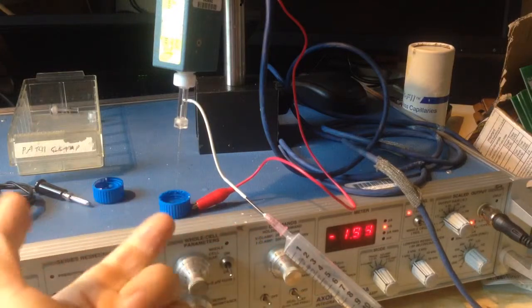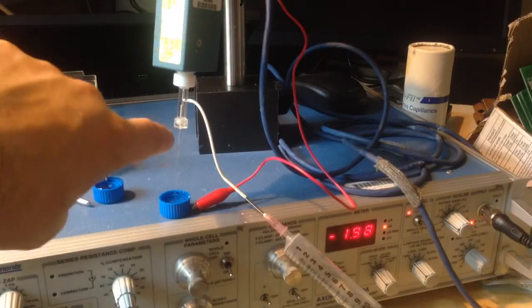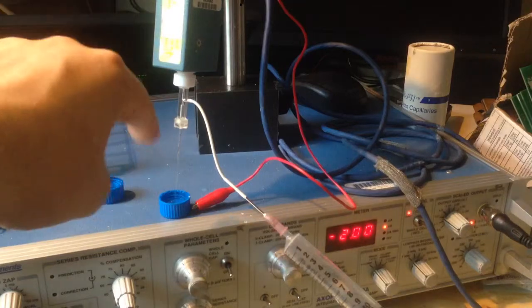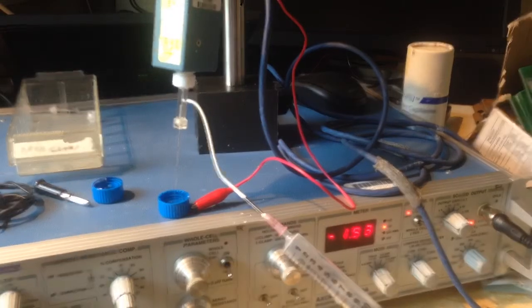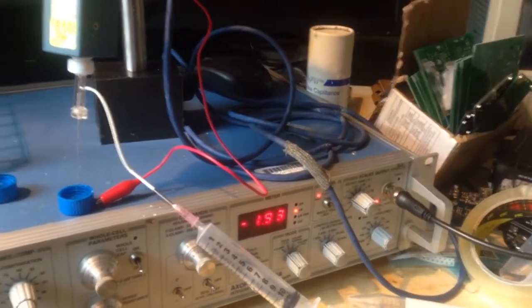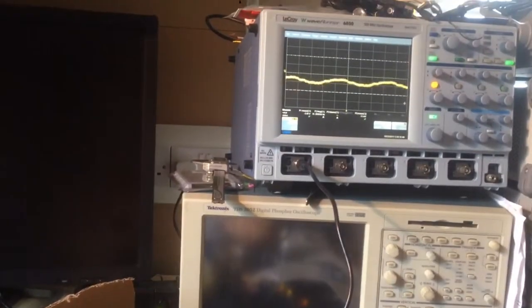You pull up some of the solution into the pipette with the syringe, and it makes contact with this silver wire, which I believe is a chlorinated silver wire, and I'm just using the silver wire that was in there when I bought it. It's actually from another rig, but it was just in the holder when I bought it. So I pulled up some of the solution into there, and then turned on the patch clamp, and it's connected to a scope. So on the scope, here's the scope.